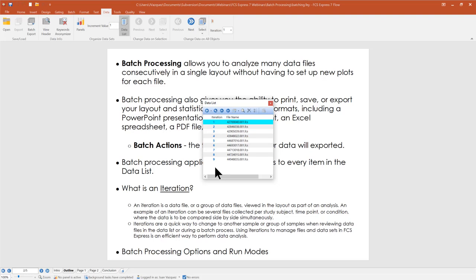The iteration is a quick way to change from one sample to another when reviewing data in your template. FCS Express knows all the different components of that iteration — all the plots where a particular file is displayed — and uses this to package and move to the next sample. We'll also talk about some of the various batch processing options and run modes available in FCS Express.